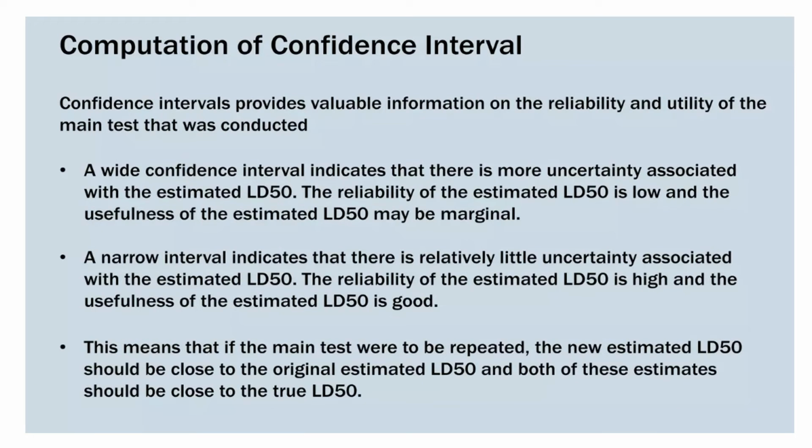Confidence interval. Computation of confidence intervals. Confidence intervals provide valuable information on the reliability and utility of the main test that was conducted. A wide confidence interval indicates that there is more uncertainty associated with the estimated LD50.